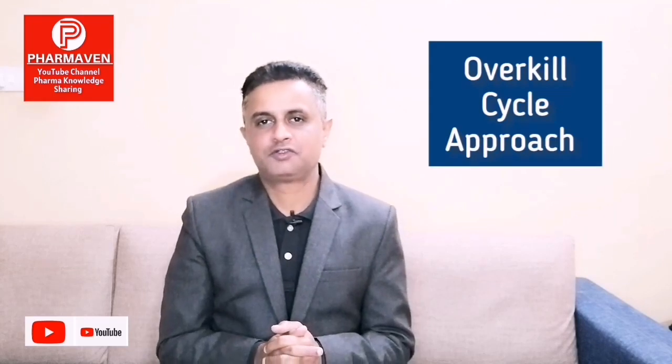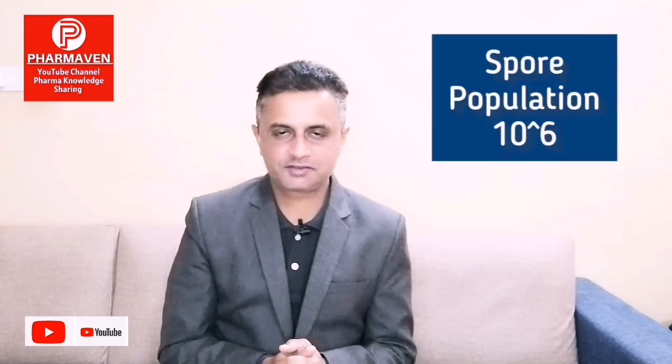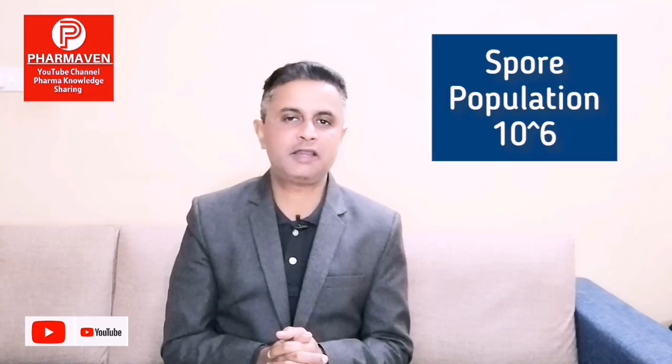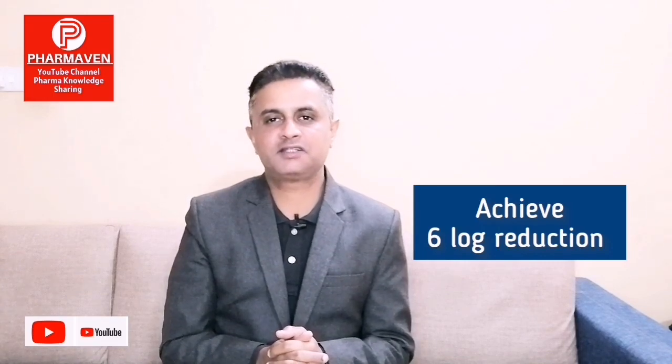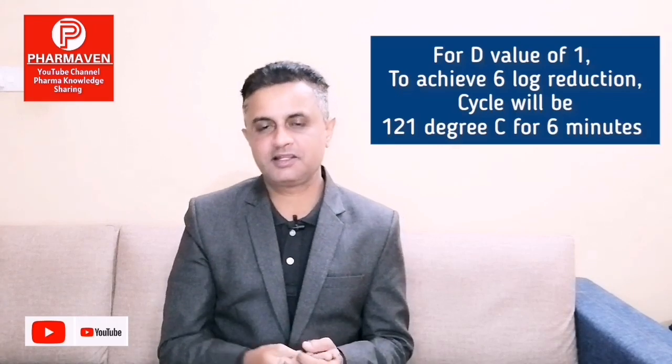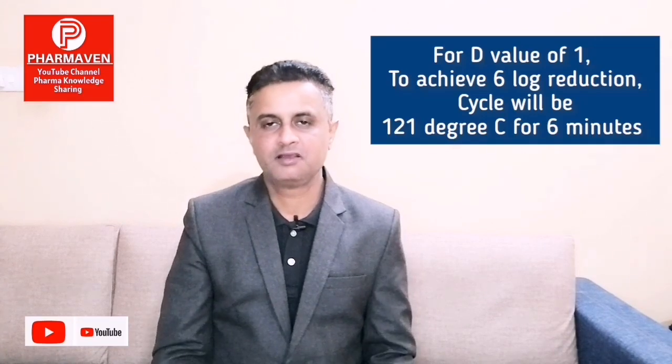Now third thing, coming to the overkill cycle approach. So what is an overkill cycle approach? If my spore population is 10⁶, and if I want to eliminate that, 6 log reduction, then I have to run the cycle. In theory, considering the F0 value, if D value is 1 and I want 6 log reduction, then I have to run the cycle for 6 minutes at 121 degree.